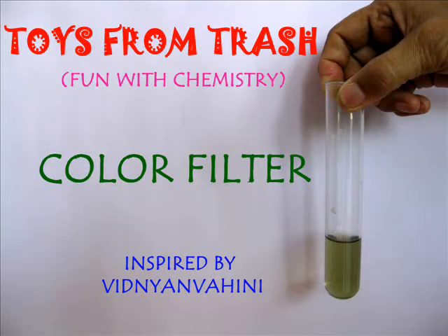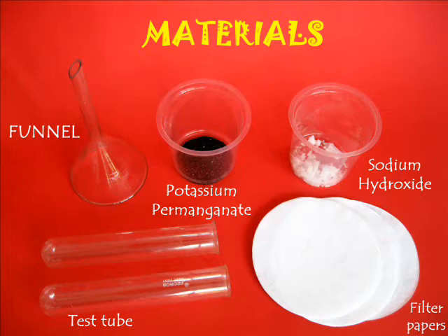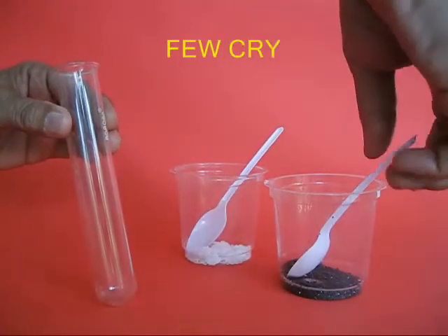For doing this interesting experiment in chemistry, you need some potassium permanganate, sodium hydroxide, and a couple of filter papers.